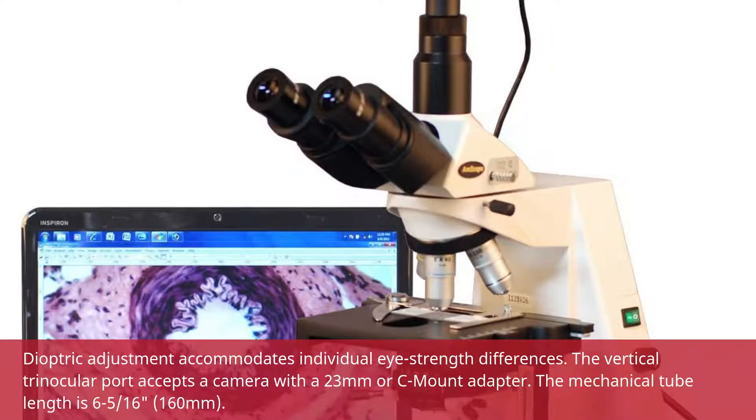Dioptric adjustment accommodates individual eye-strength differences. The vertical trinocular port accepts a camera with a 23mm or C-mount adapter. The mechanical tube length is 6 and 5/16ths inches, or 160mm.